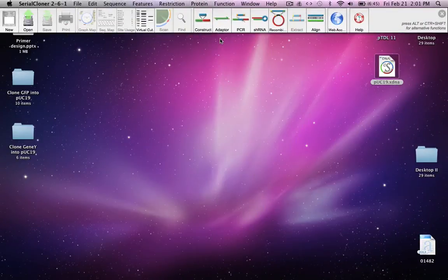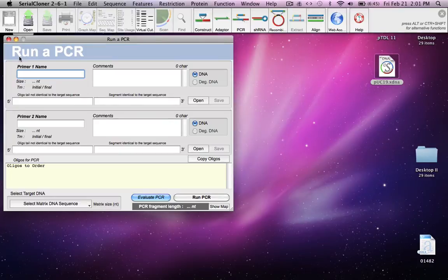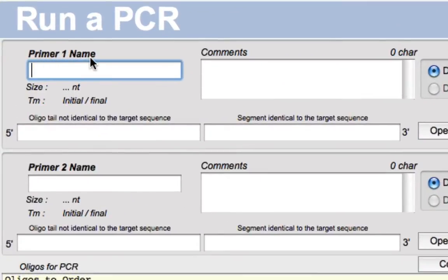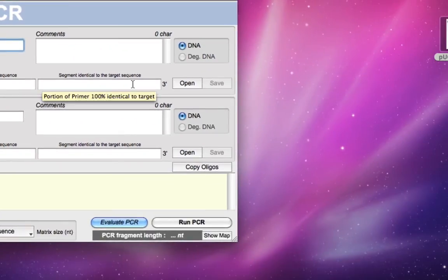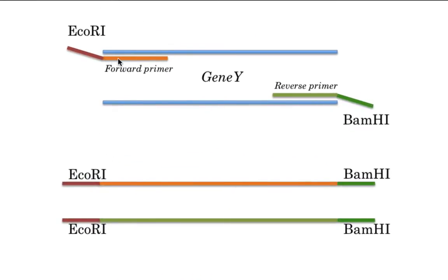Now let's do the PCR. In the top panel, look for the box that says PCR and click on it. That opens a new window where you enter the primer name, then the oligo tail that is not identical to the target sequence, and adjacent to it the primer sequence which is identical to the target sequence. In the forward primer, the portion identical to the target sequence is the binding region, while its tail containing the ECO R1 site is non-identical — that's why it's dangling in air. Similarly, the reverse primer's tail containing the BAMH1 site is not identical.